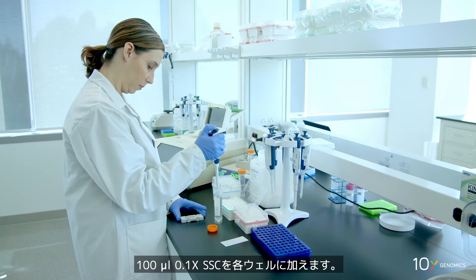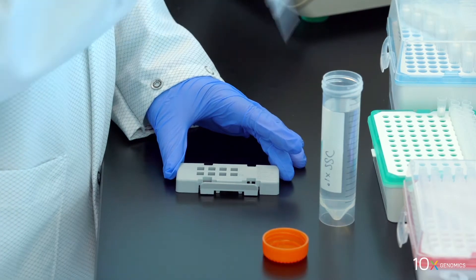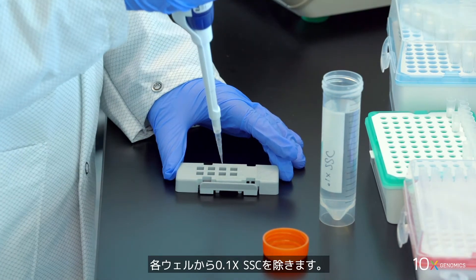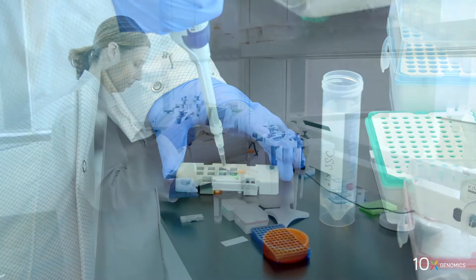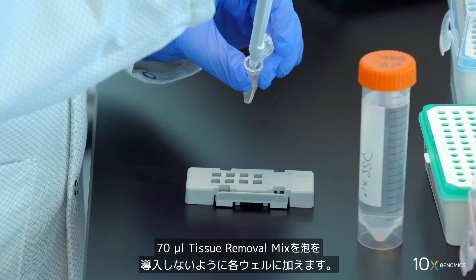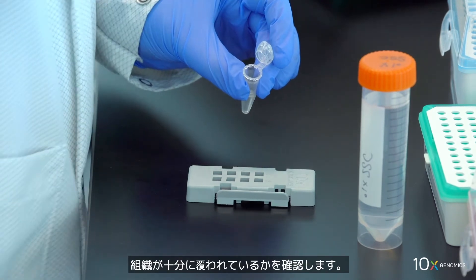Remove the slide seal and remove fluorescent RT master mix from the wells with the pipette set to 100 microliters. Add 100 microliters of 0.1x SSC to each well, then remove 0.1x SSC from each well. Add 70 microliters of tissue removal mix to each well without introducing bubbles.